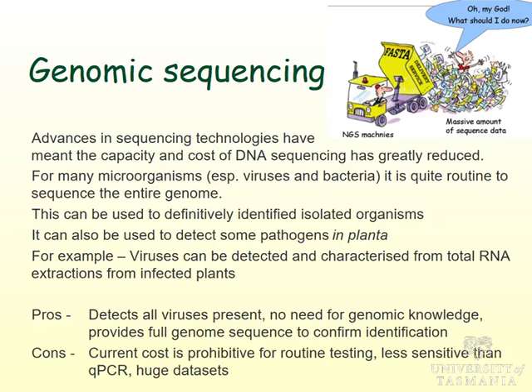The issue these days is data overload. So these what they call next generation sequencing technologies, this has revolutionized the process. This has caused where you get massive parallel sequencing, and you pump in a sample and it'll sequence the whole lot and give you huge amounts of information that then you have to try and deal with. Talking about many gigabytes of data.